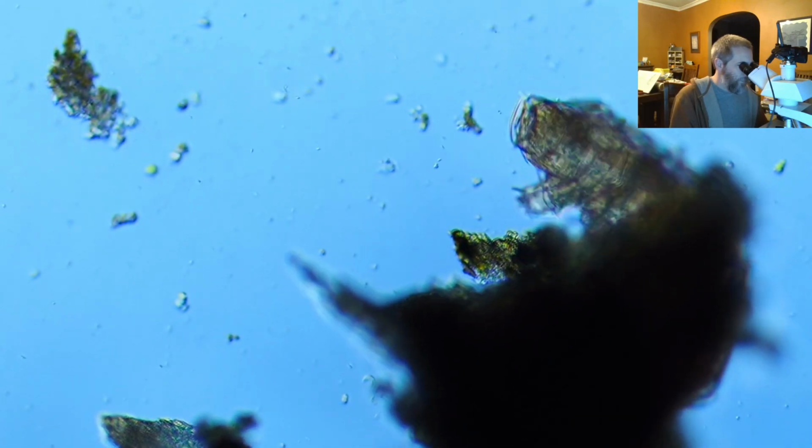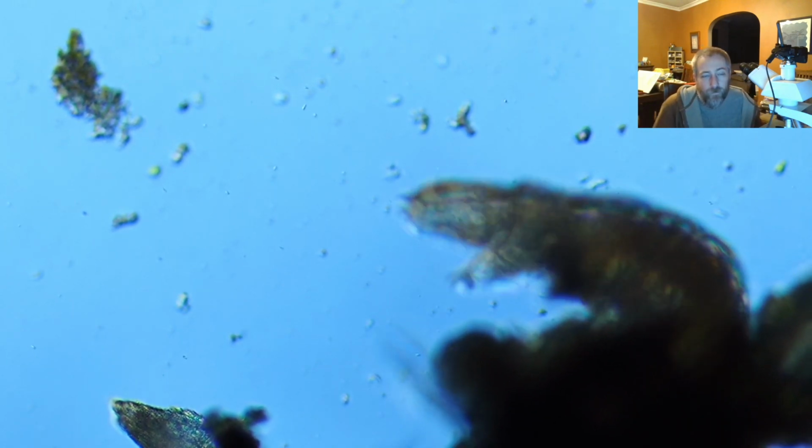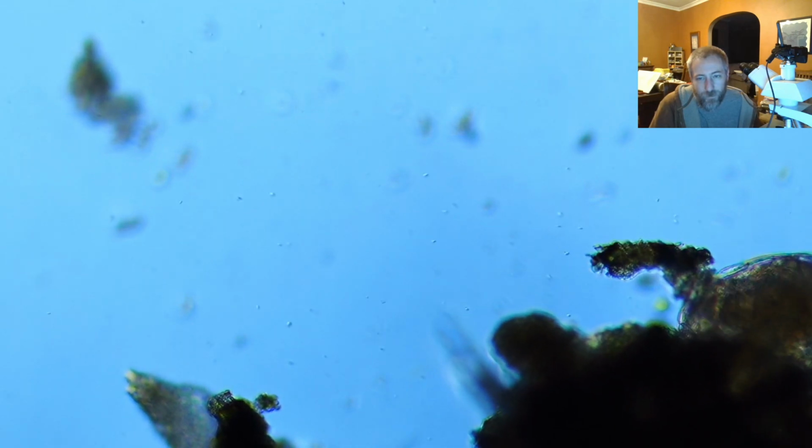You can see those little doodads coming off of its face right there. But there's water bears that are adapted to living in very cold conditions. And there are water bear experts around the U.S. I think there's one of them in California that studies water bears in Antarctica. And they look for them in cryoconite, these little puddles that occur on the top of glaciers where dust settles in them, and the dark color of the dust basically causes the ice to stay melted. And yeah, I think it's 1,300 species of water bears. So there's a lot of them.